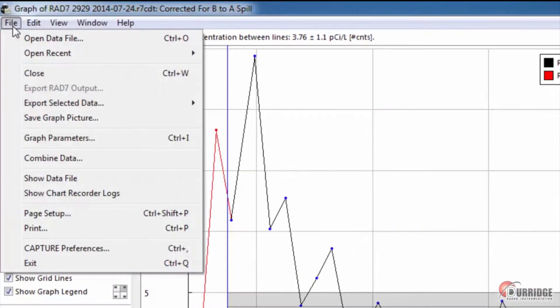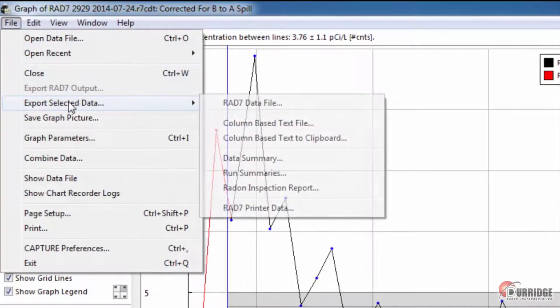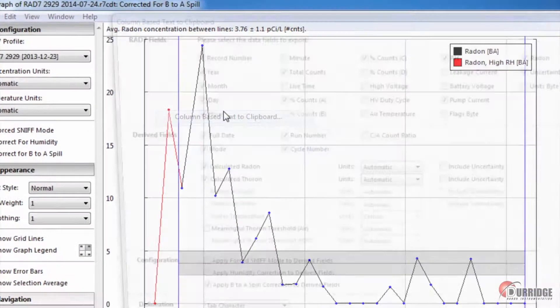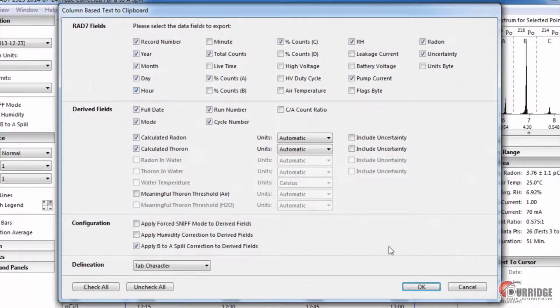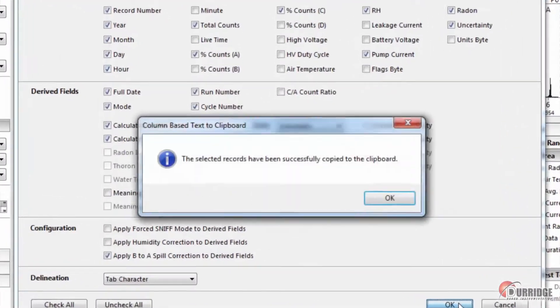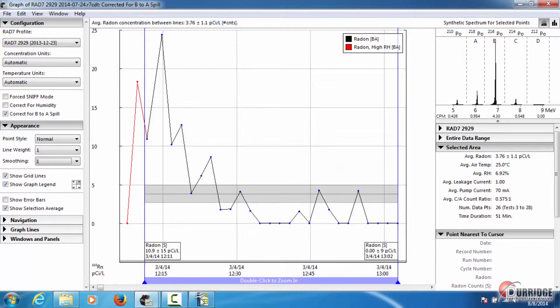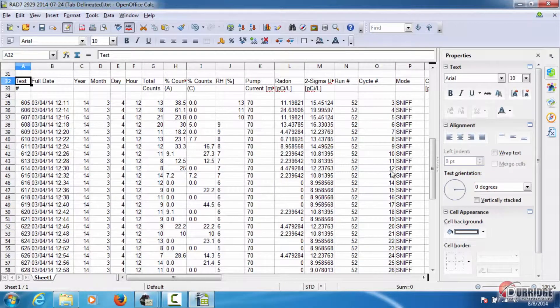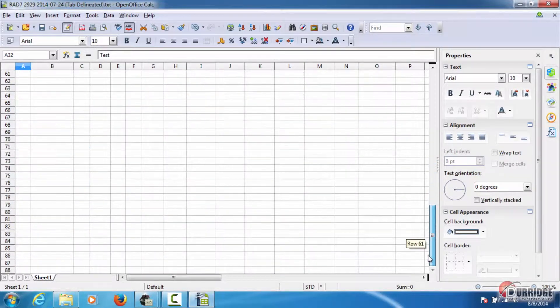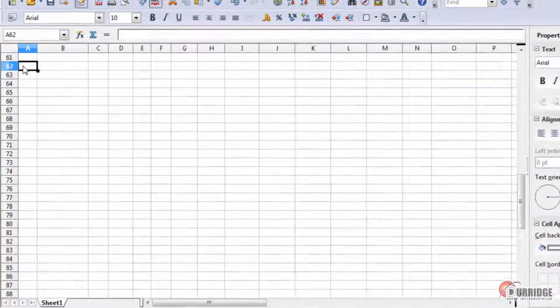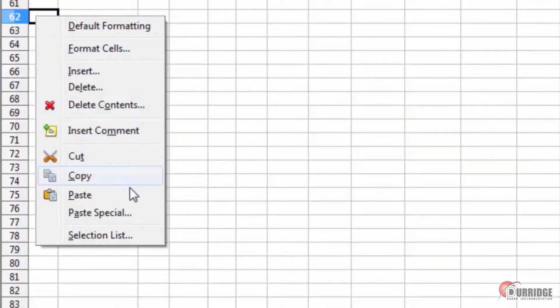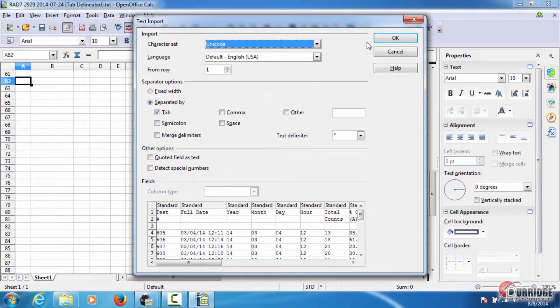Exporting as column-based text file to clipboard saves the same information as in column-based text file, except instead of creating a file with the information contained, it copies the information onto your computer's clipboard so that you can paste it into a spreadsheet.